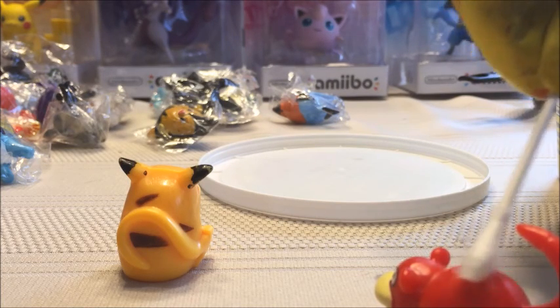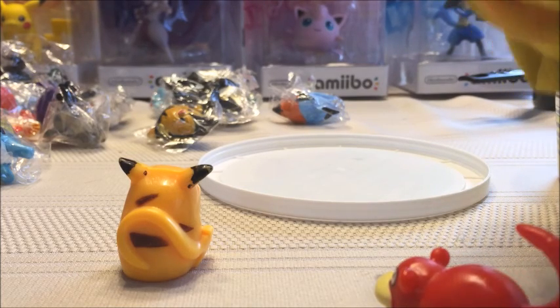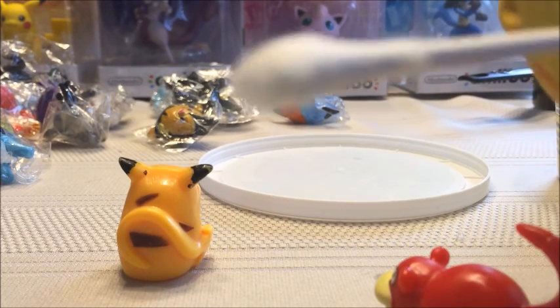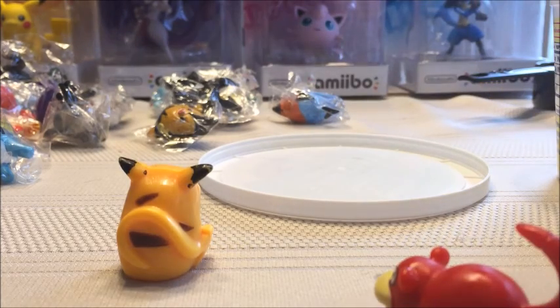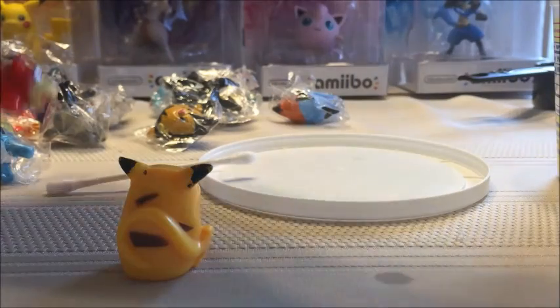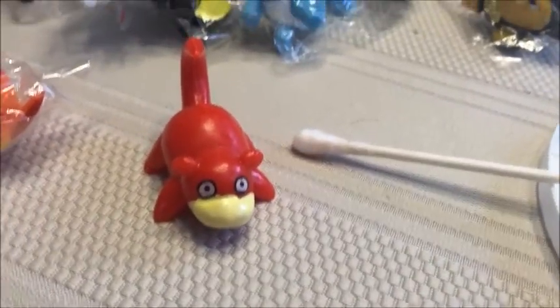It says any violet or blue color change is a positive test. We've got it on there and I already see a little bit of blue. It says it'll take one to ten minutes. So we'll put this one over here, and we'll put the knockoff Slowpoke — which looks really weird anyway — to test next.